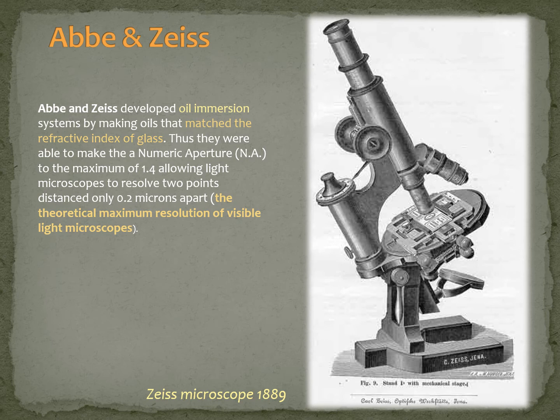And this is something that fascinates me, how they could do it, how they could predict this such a long time ago, at the very beginning of light microscopes. In practice nowadays we can actually go a bit further in resolution, but some tricks have to be used, some mathematical tricks or other systems that are not in the scope of this talk. But by using a light microscope, this resolution cannot be broken by direct observation.